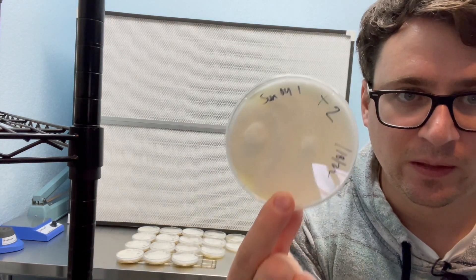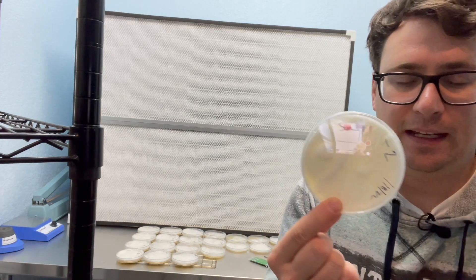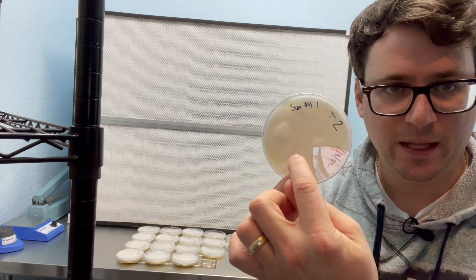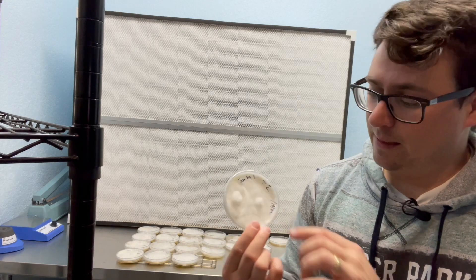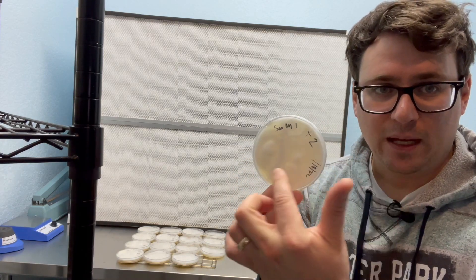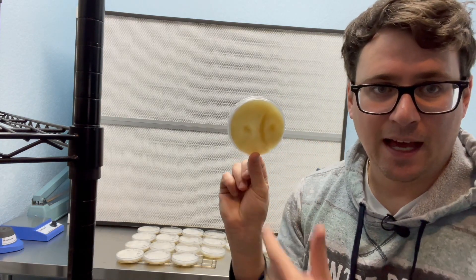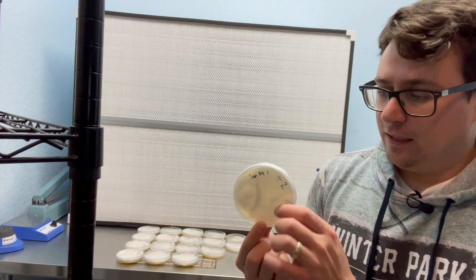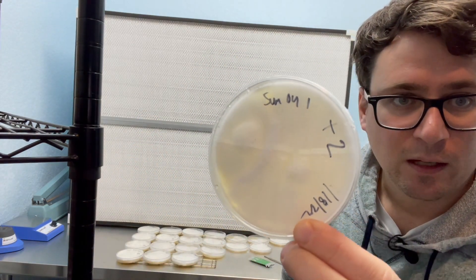So before we get into the selections I just wanted to go over this really nice banding here. This is the ideal pairing that I'm looking for. It's got most of the plate covered within a week and a really nice banding. So I get a lot of questions about whether or not you should take your sectors from the middle or either side. Honestly I don't really know. I always shoot for the middle just because it seems like there's the most rigorous growth where they meet. However, I think that you will be able to kind of pick and choose from wherever on the petri dish. I just try to avoid that because there could be contaminants hiding under the surface that we just don't see.